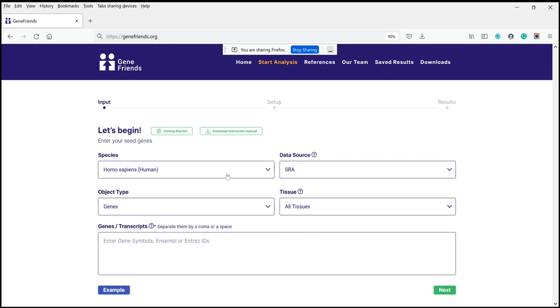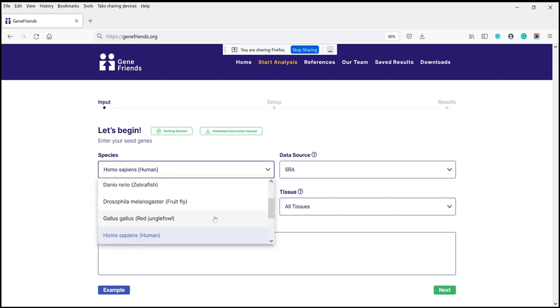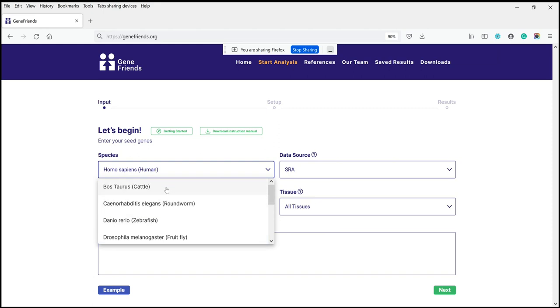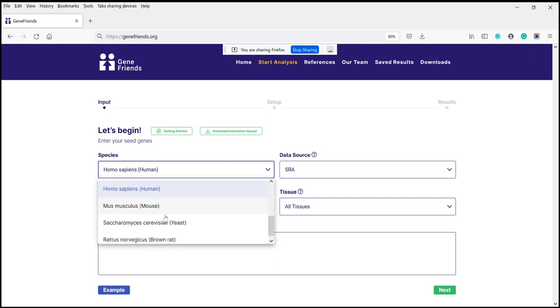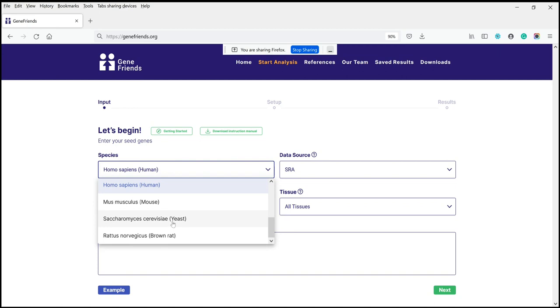First of all, there are various options for species, including humans, and several animals including cows, roundworms C. elegans, zebrafish, the fruit fly Drosophila melanogaster, chicken, mice, yeast, as well as rats.